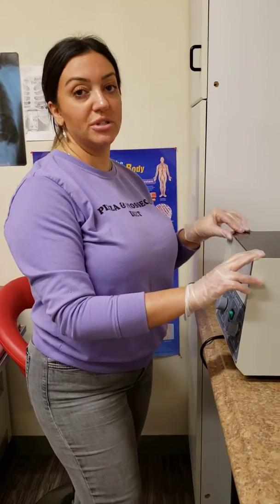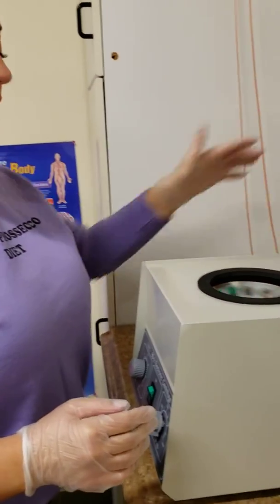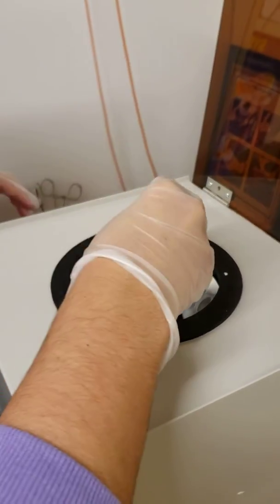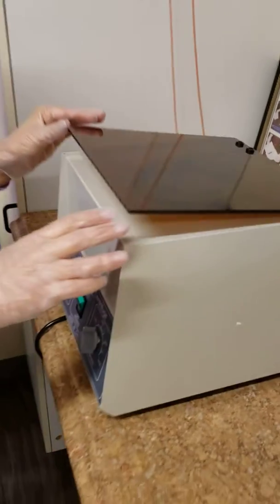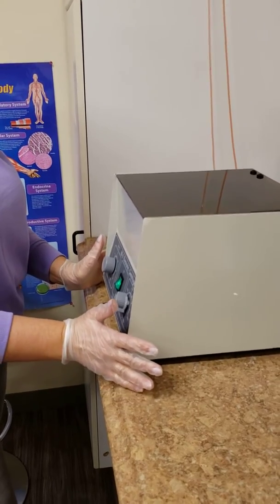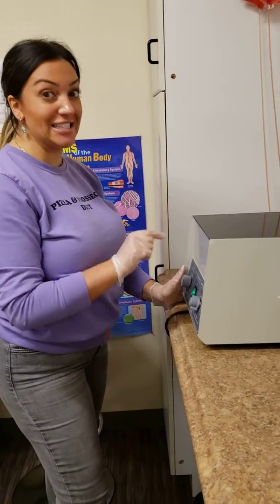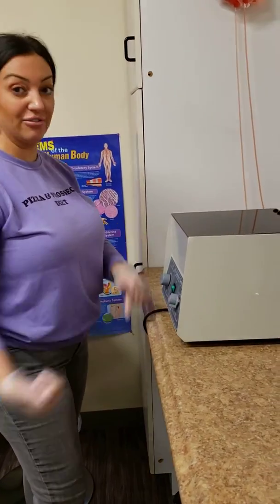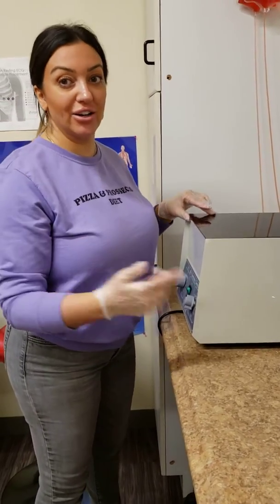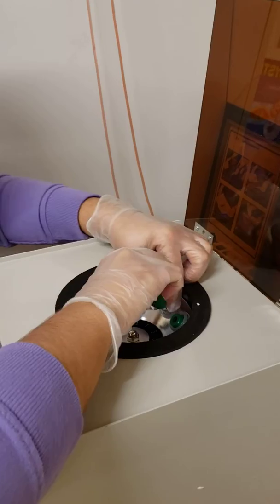If I turn this off and I purposely load the machine unbalanced, you'll see right away once I turn it on that the machine will vibrate and potentially can walk right off the table. So if I put these here, now it's unbalanced. — Yeah, huge difference. This is not balanced. Those tubes could break. The machine could fall off of the countertop. That is not good. That immediate indicator tells you there's something wrong and your machine is not balanced. It should not vibrate like that.